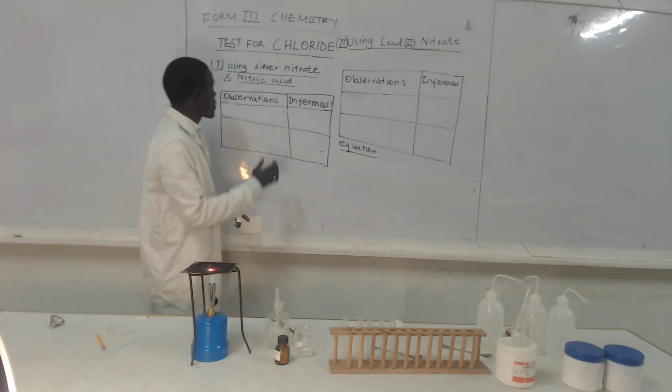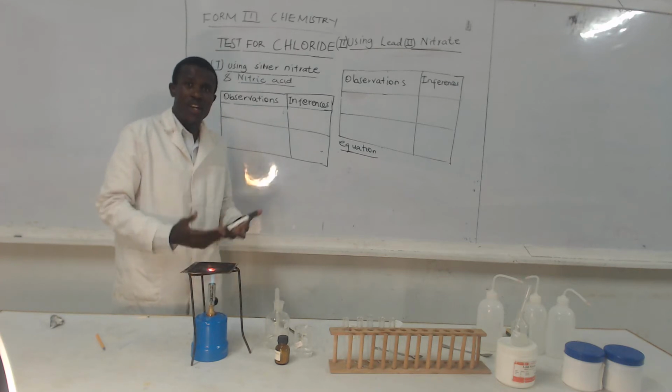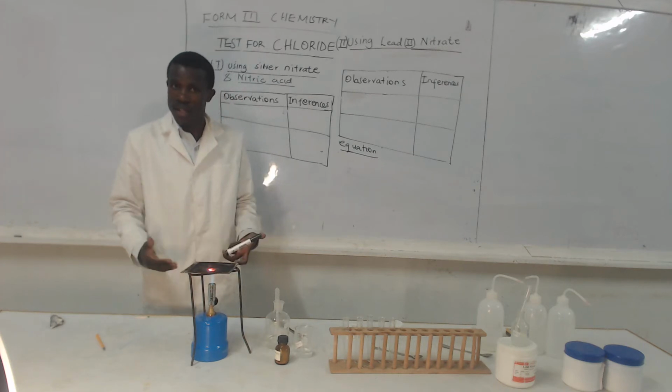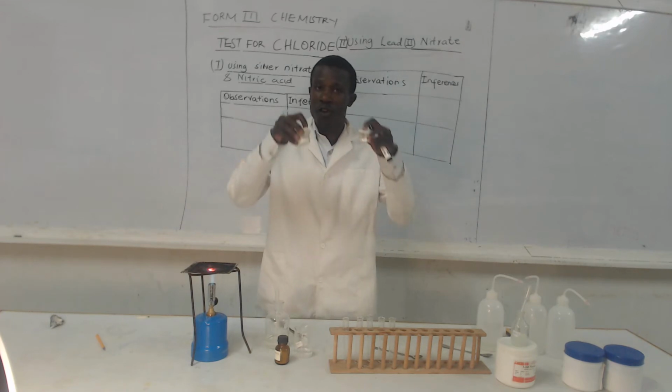Our today's focus is test for chlorides. How can you test for the presence of chloride or the absence of chlorides? Say for example, you have been provided with the following samples.